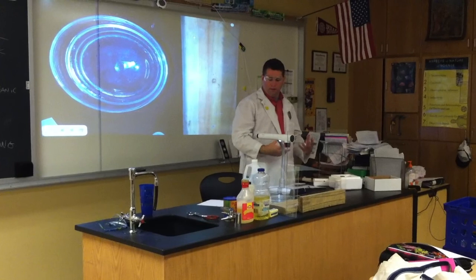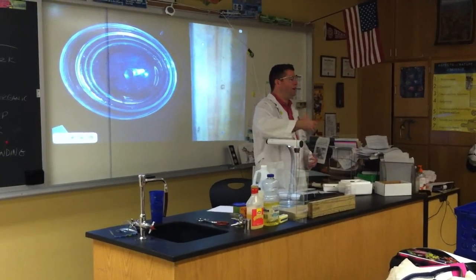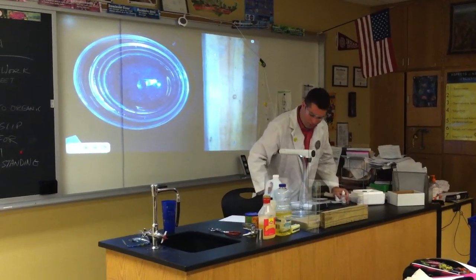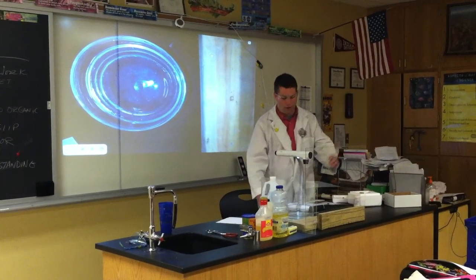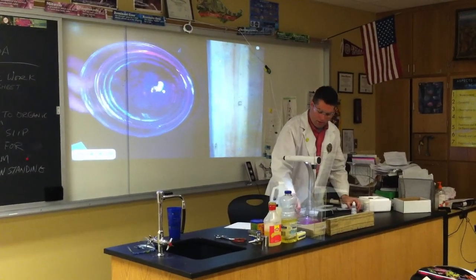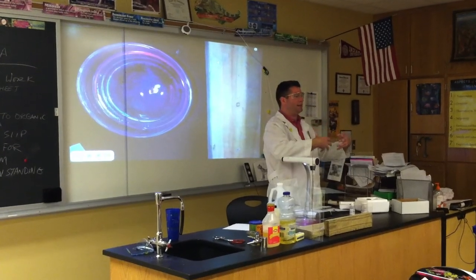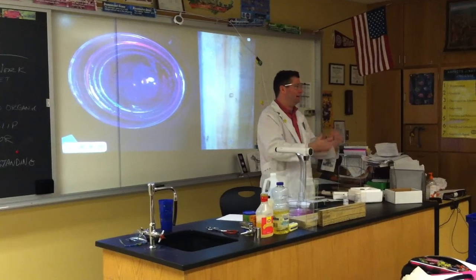All right, the other thing that you need to know is that since these are called the alkali metals, it actually makes this solution basic. So what we can do is put some indicator in here, and it turns a pink color. It's actually causing a basic reaction. So that's like soap or bleach. It's making it more basic than acidic.